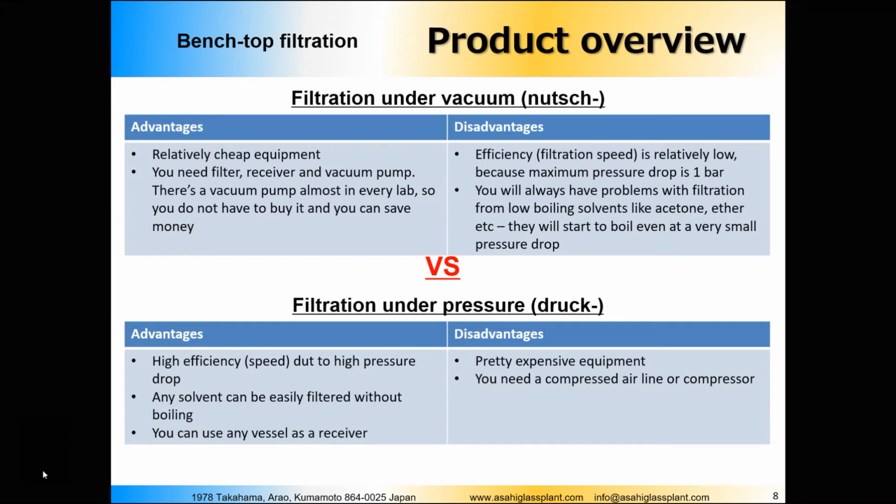So these are the disadvantages. Filtration under pressure. What are the advantages of the filtration under pressure? Well, first of all, high efficiency due to a high pressure drop.